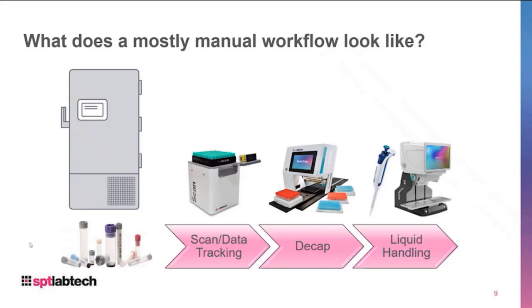In this case, we're considering a screw cap set of tubes. Different shapes and sizes, of course, are out there. This is just a representative, well, small grouping. And so in this area, you'll see things like scanners for getting data into a management system, both hand scanners, and in this case, we have a cryo scanner here that is another option for fast batch upload scanning.